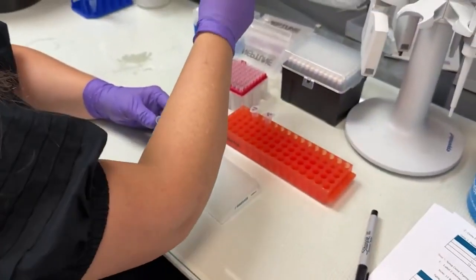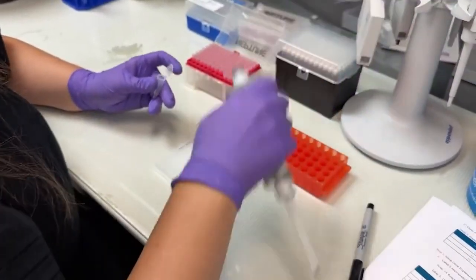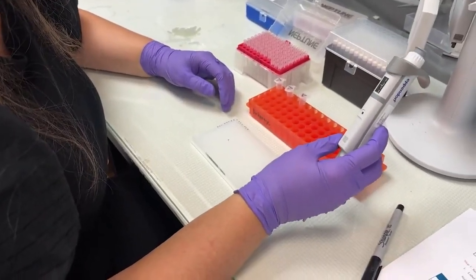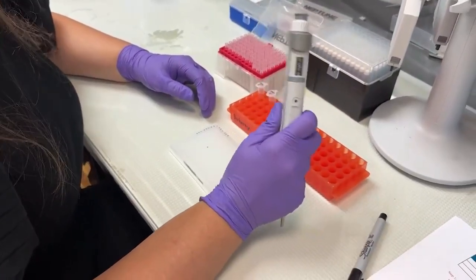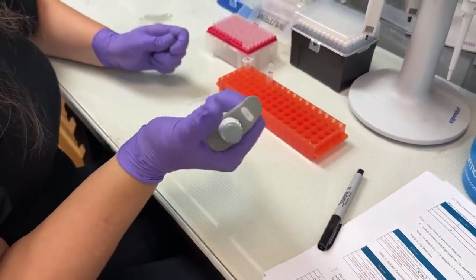And I don't know how you guys do about calibrating your pipettes in your labs, but I was never very good about it. So if there's anything wrong with your pipette, you're going to have more problems at 1 microliter than you will have at 2. So I like to recommend 2 microliters just to be consistent and accurate. Okay, so that was sample 1.